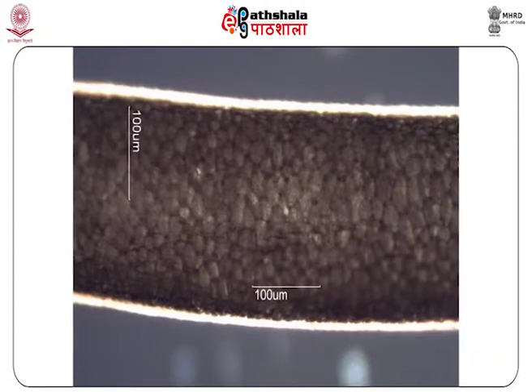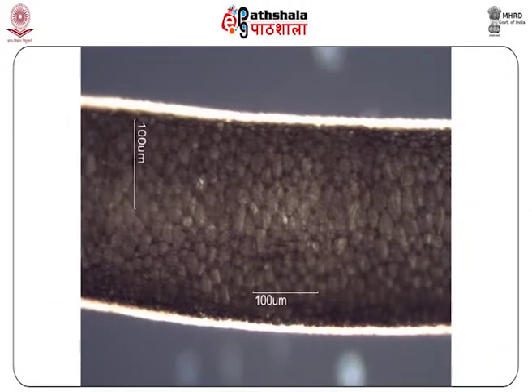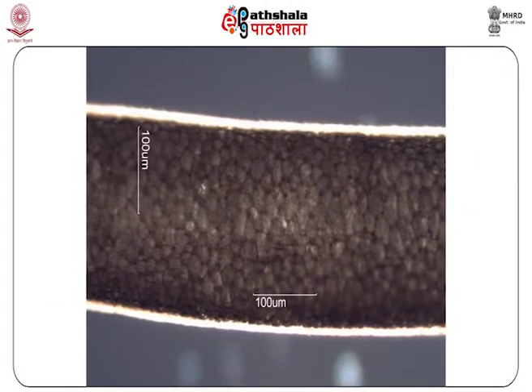Identification of species is done by the general shape of the medulla. The cylindrical medulla is present in many animals as well as humans. The pattern shaped medulla is present in other animals. For example, deer hair appears as oddly shaped spheres crowded close together.